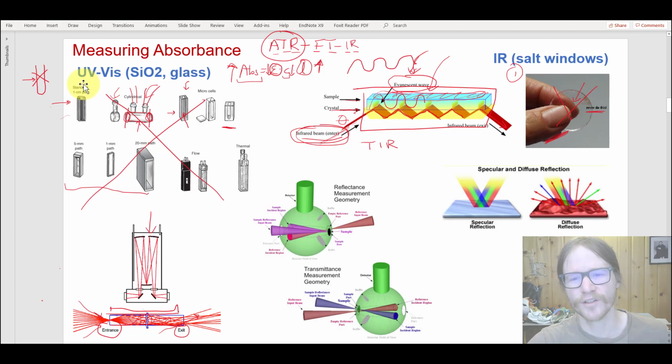Of course, the crystal we use is made of diamond, synthetic diamond. Typically the materials here to get this to work are pretty expensive, but they last for a long time as long as you treat them right. And so this was the tool that you used, which was the attenuated total reflectance adapter to a standard Fourier transform infrared absorbance cell. So I'll just mention briefly for your own understanding, because these are super powerful techniques.